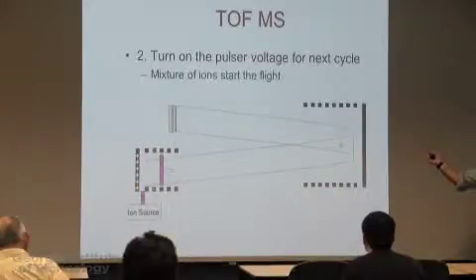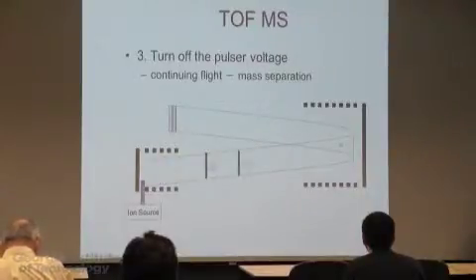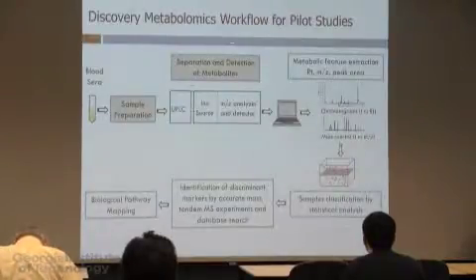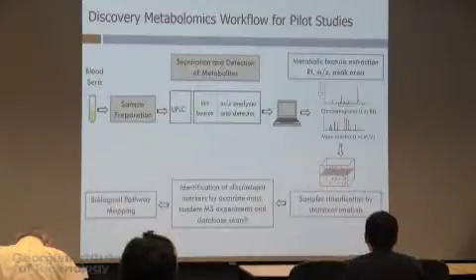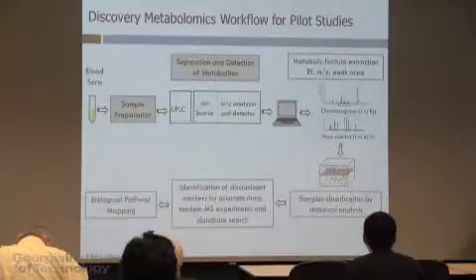And this process that took me 3 seconds to scroll through the slides happens in microseconds. Okay, so this is a very fast instrument. It's keeping up with the chromatography that is happening. Okay, so I'm going to go quickly through that. So you separate in the UPLC, and you further separate in your mass spectrometer. The computer hopefully is keeping up with this and detecting everything that's hitting the detector. And you're going to end up with this bidimensional data, which is chromatography in one axis and mass spec in the other axis, okay, for each sample.